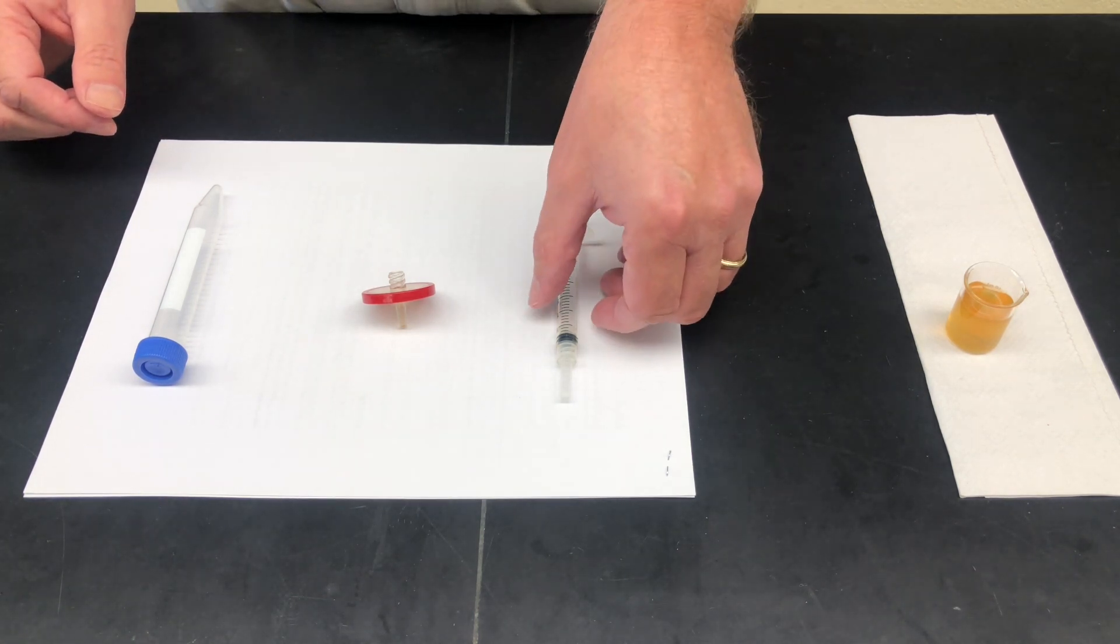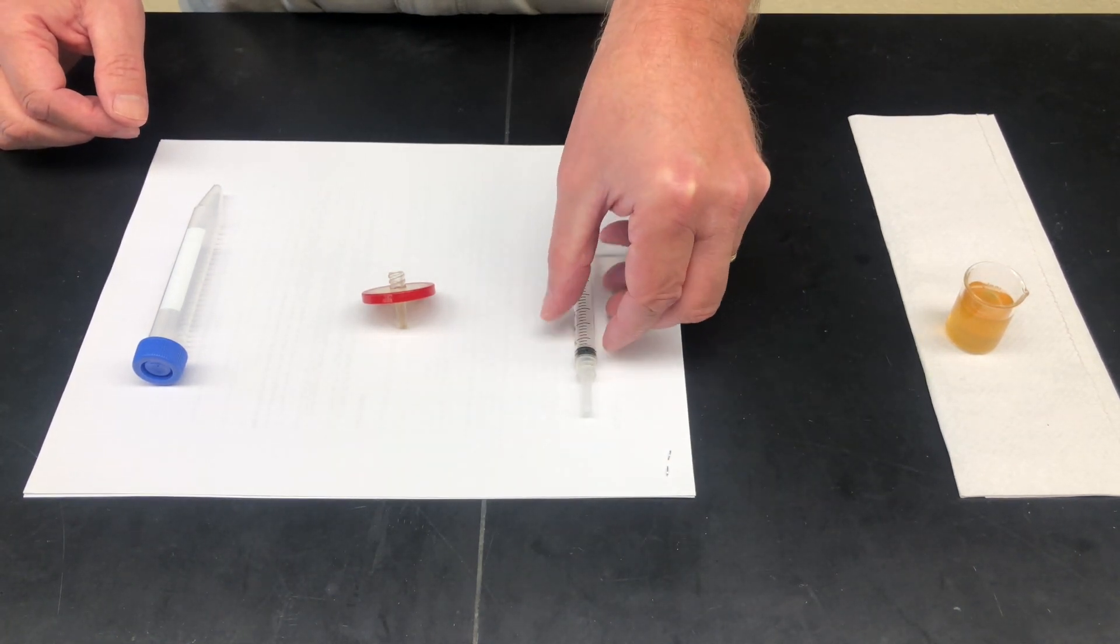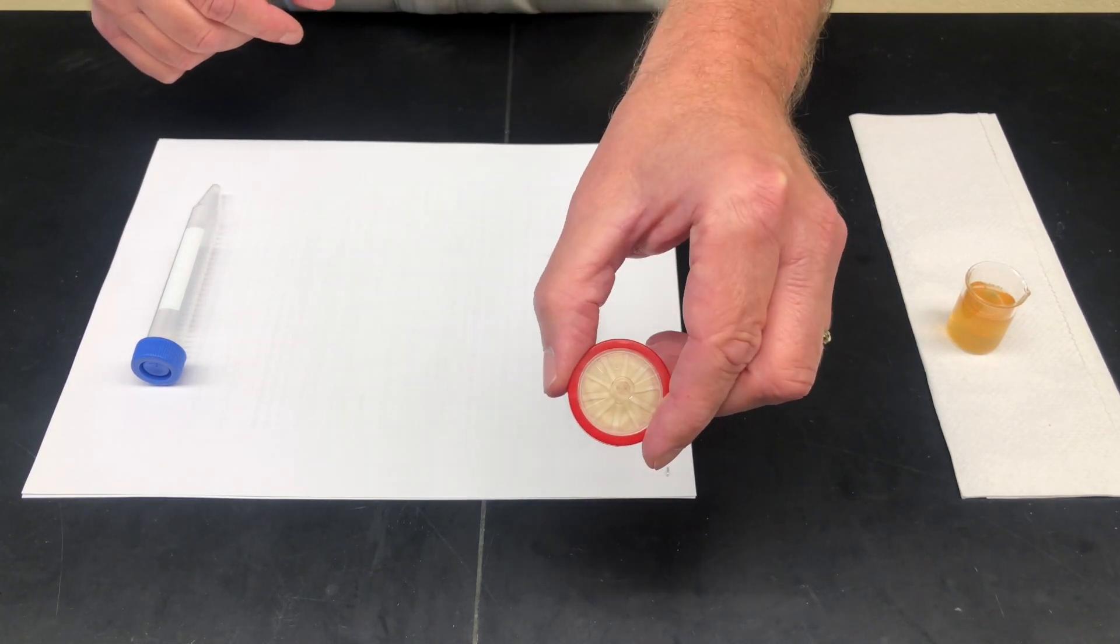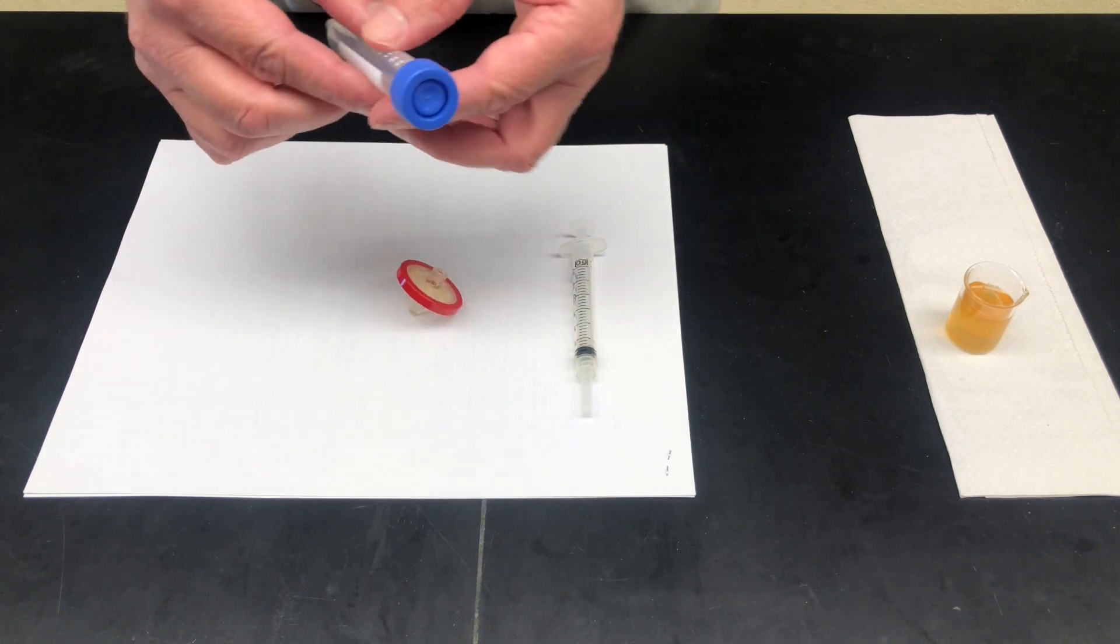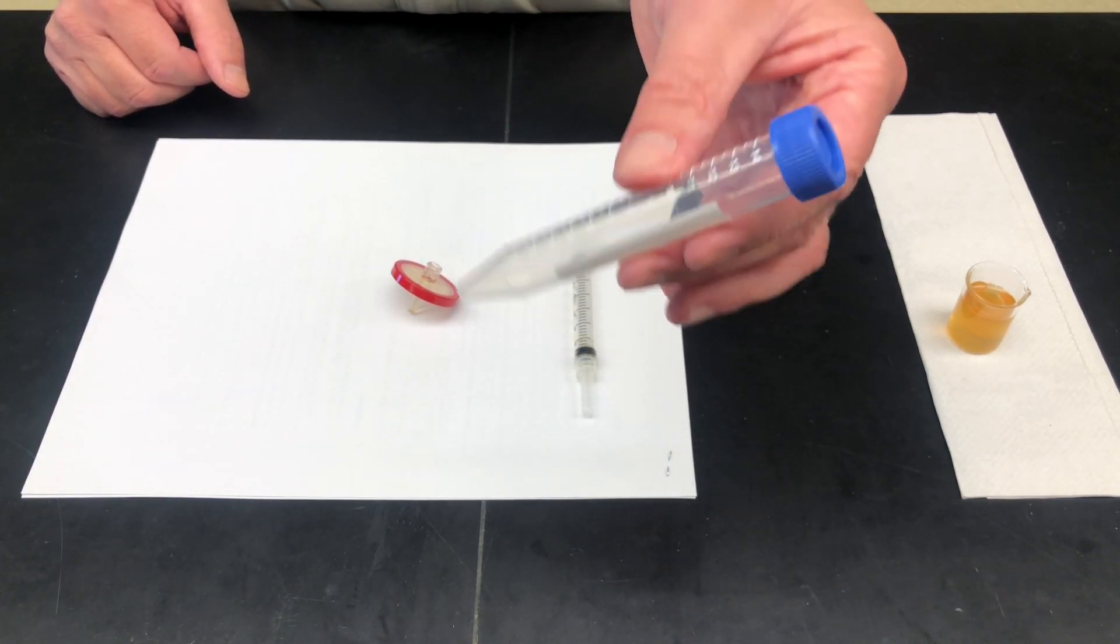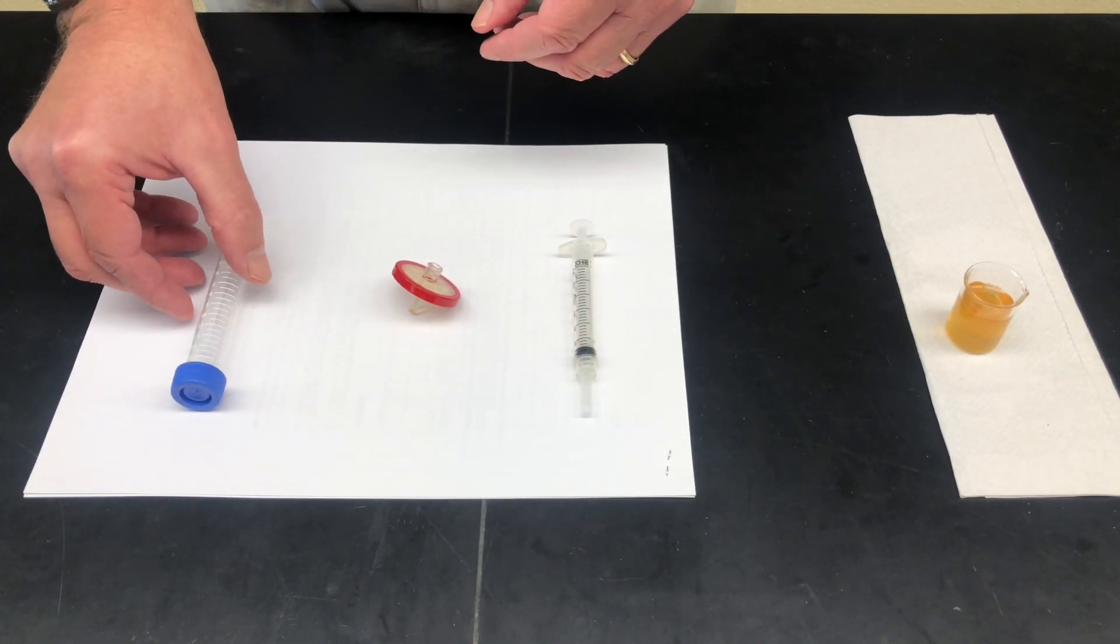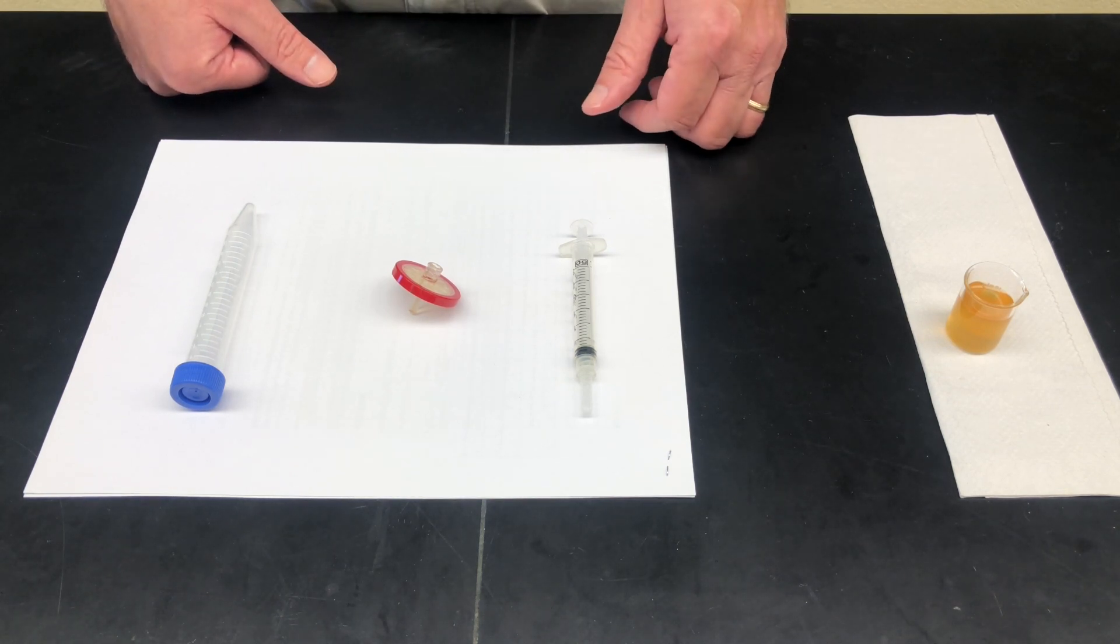The first item you would have is the syringe. The second item present in the kit is the actual filter, which looks like this. And then finally, we have a conical tube for reception of your sample. Your sample would be shipped to us in this tube. So now I'd like to show you how you would actually prepare a sample for us.